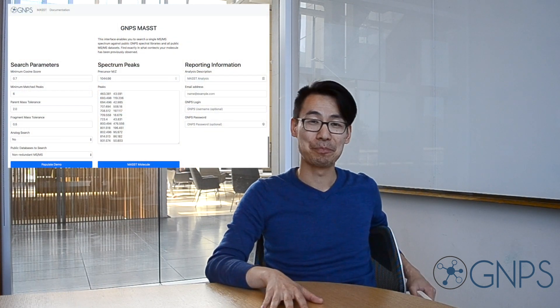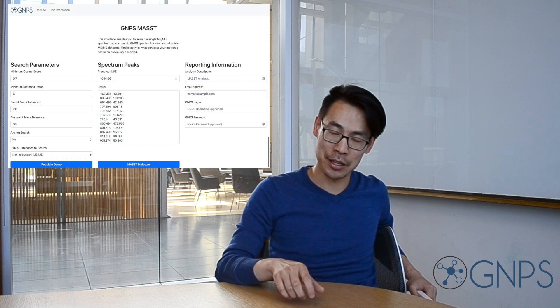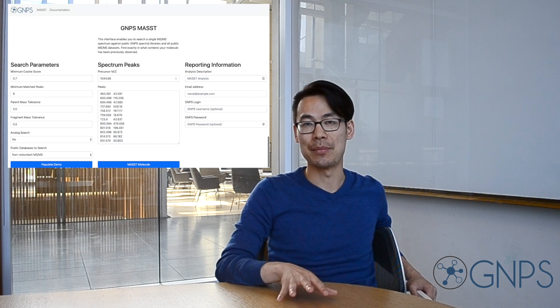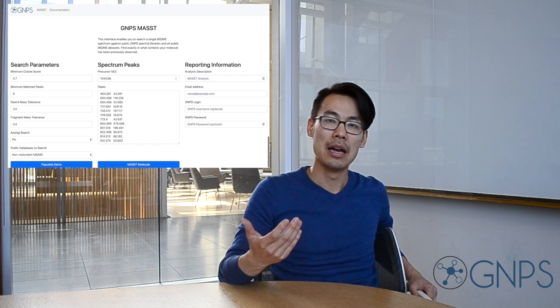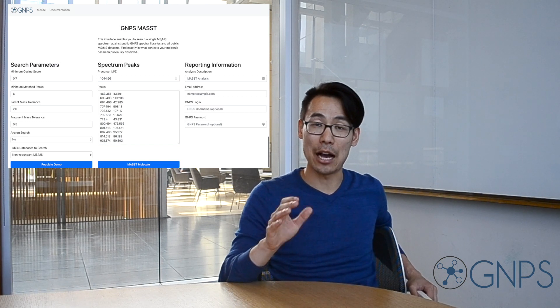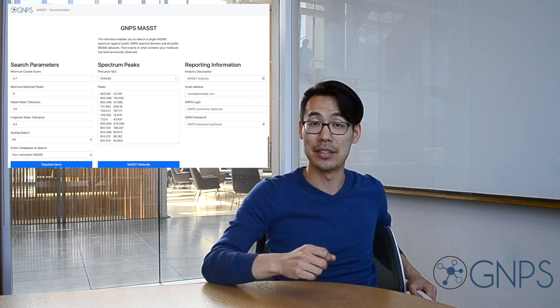First, navigate to the MAST page — the link is provided below. The key thing you'll need is your actual MS/MS spectrum. This includes the precursor m/z of the molecule as well as the actual fragmentation peaks — that is, the mass and intensity of the tandem mass spectrum. You should be able to export this from your vendor software or open-source software. You can also pull the peaks out of MGF files and MSP files.